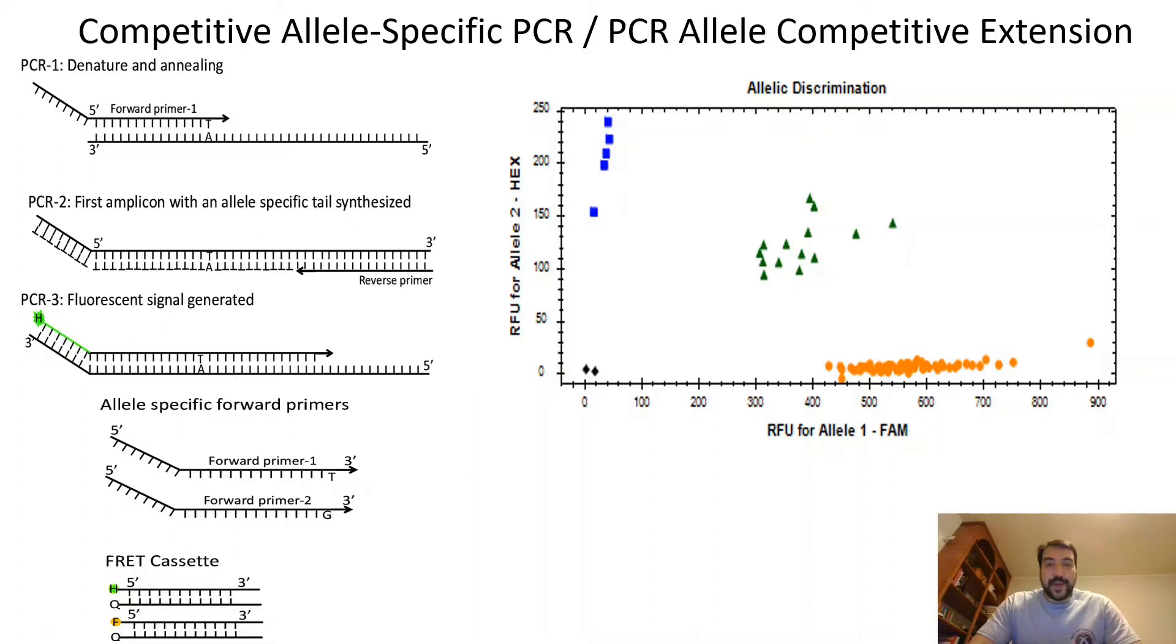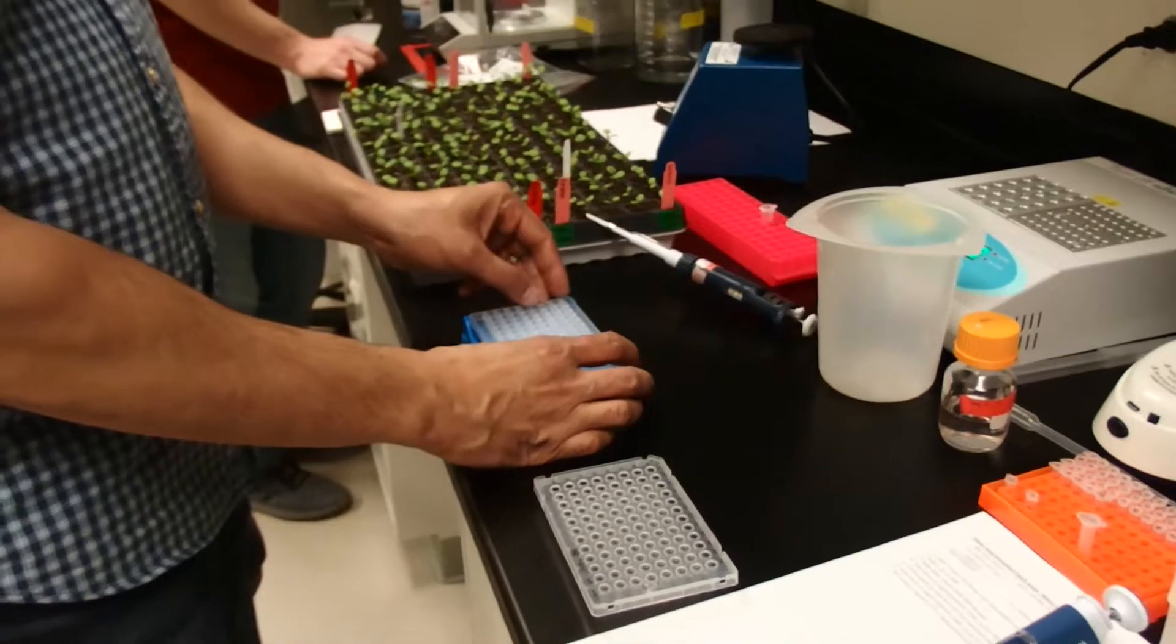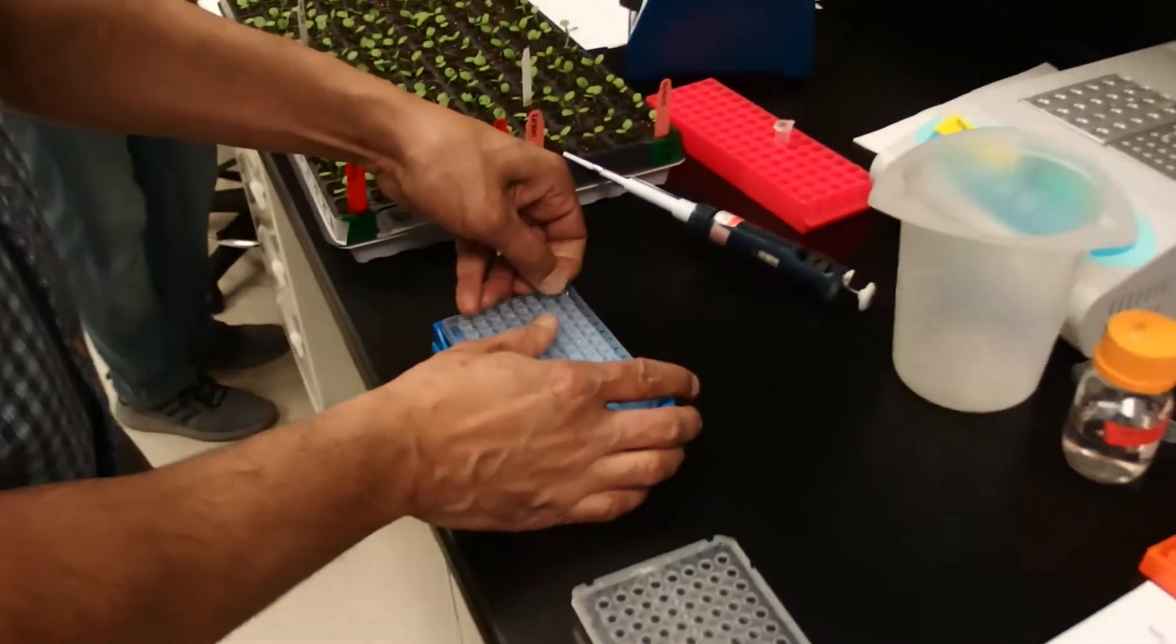In this video I'm going to show you how to set up an allelic discrimination PCR assay where we use Sigma extract and amp DNA that we prepared previously from plant tissue. With this assay we'll be able to separate alleles into homozygous mutant, heterozygous mutant, and wild type calls. I'm going to throw away all their strip caps because it's hard to keep track of all these guys.